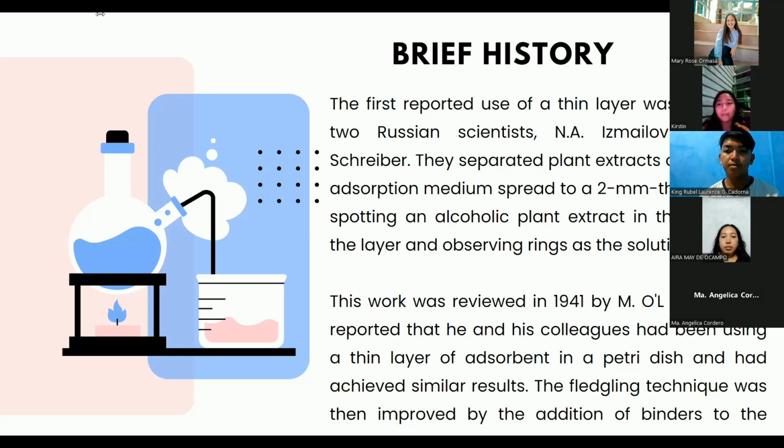The main problem in chromatography is the development of the apparatus, for example for column chromatography. But the accurate identification of adsorbed substances is changed from the closed to the open column, which was the thin layer chromatography.